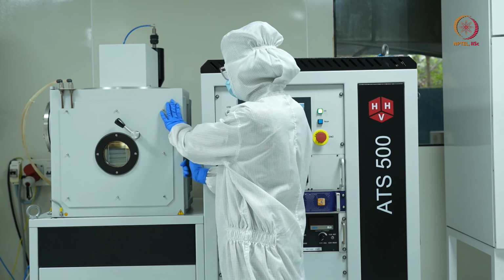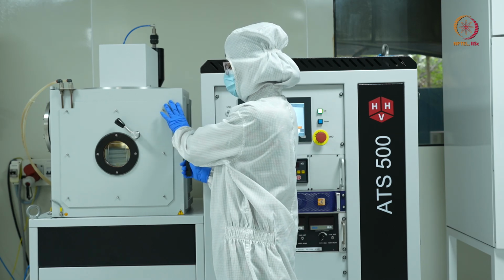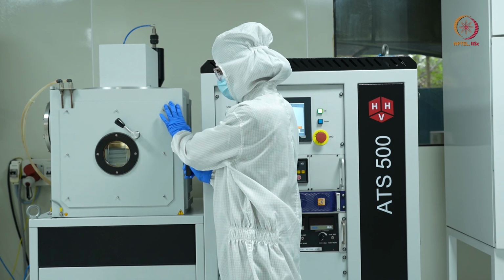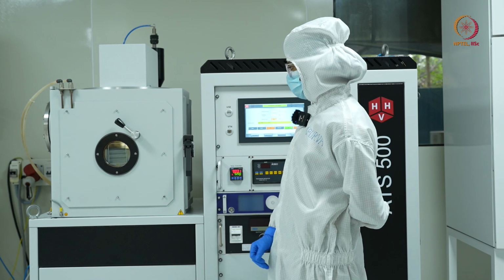I'll try to open the chamber now. Still there is some vacuum left in the chamber. We'll wait for a couple of seconds more.